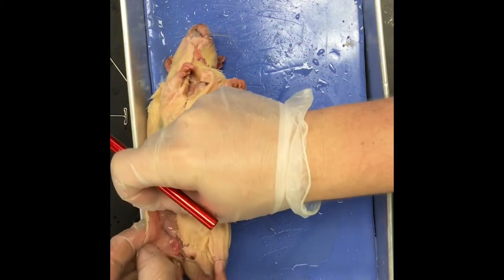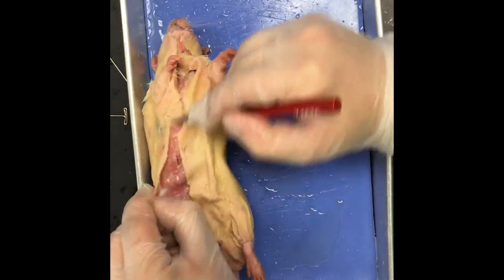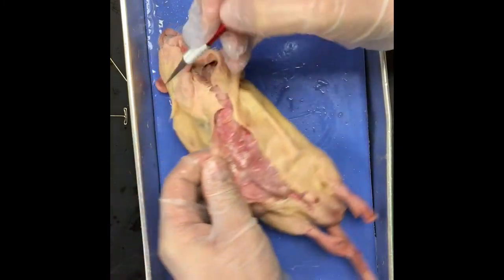How would there be no blood in it? Like, did they take all the blood out of it? They pump out the blood and they pump in the latex. Is that why it's shriveled? Yeah. Okay. They use formaldehyde.